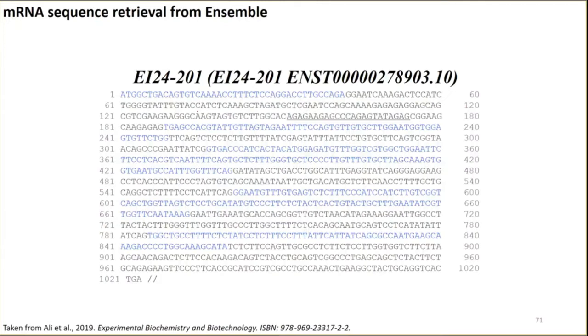And you can see some of the bases are shown in blue and some of the bases are shown in black. These blue and black are actually the alternative exons.